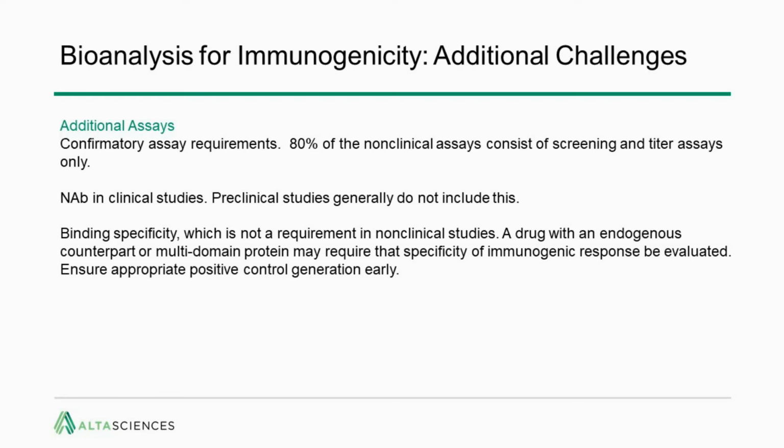Secondly, NAB assays are required in the clinical studies, whereas in preclinical studies, they're generally not included. The NAB assays consist of in vitro neutralization assays to indicate the potential of the anti-drug antibody response to inhibit the therapeutic activity of the product.